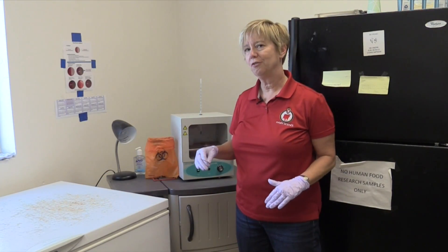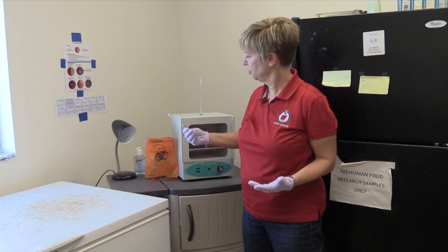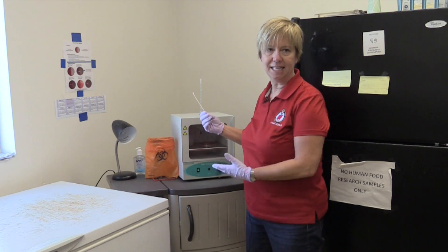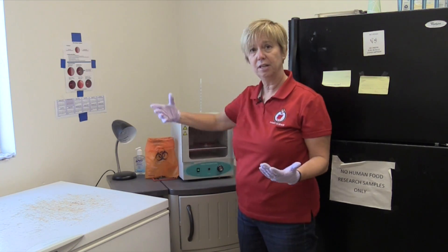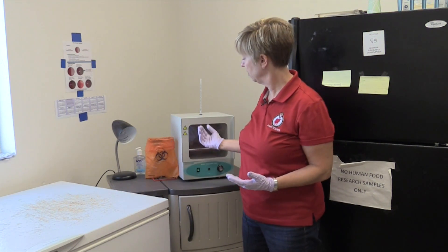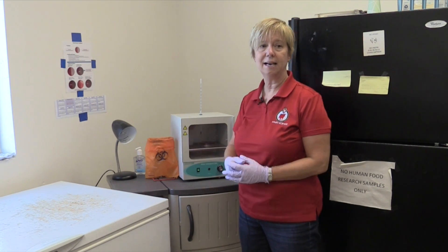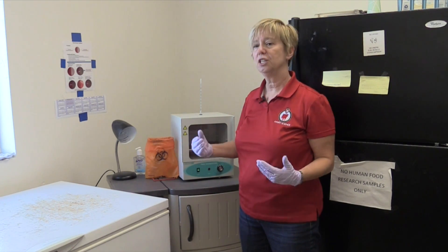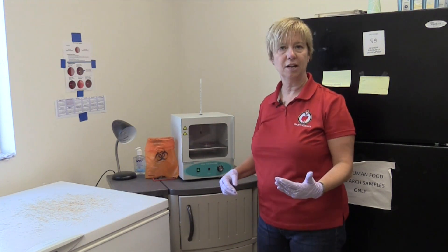Another important consideration for an on-farm culture program is disposal of the waste, such as used swabs or plates after we're done reading them. In many instances we can have a biohazard disposal bag on the farm. We've got ours located right next to the incubator. We can put our used supplies in that biohazard bag and then dispose of it according to local regulations. If you have questions, you could ask your local veterinarian for guidance on how to deal with this waste.